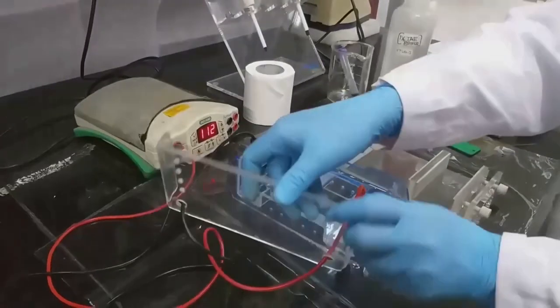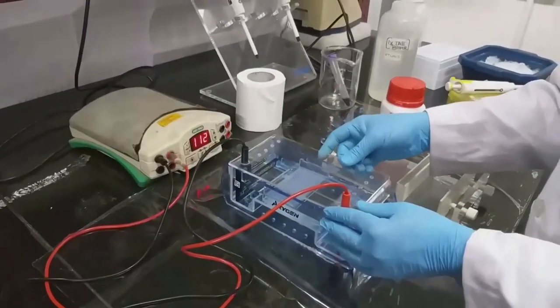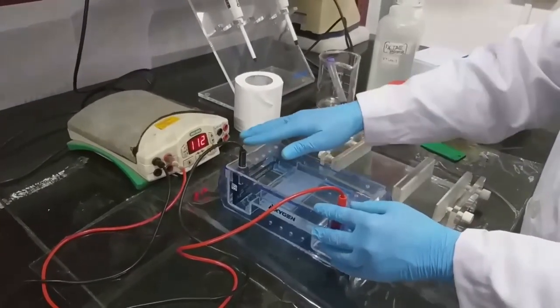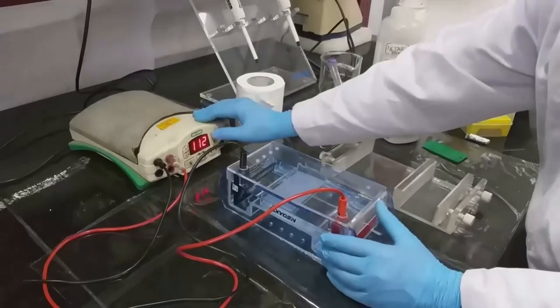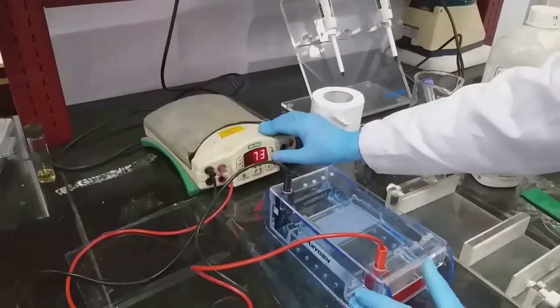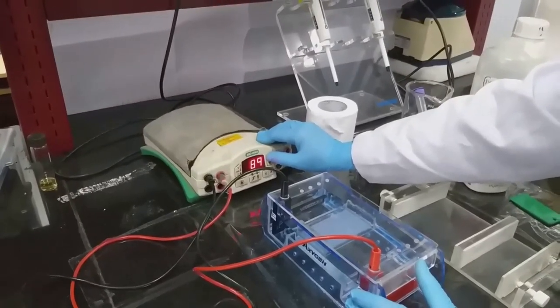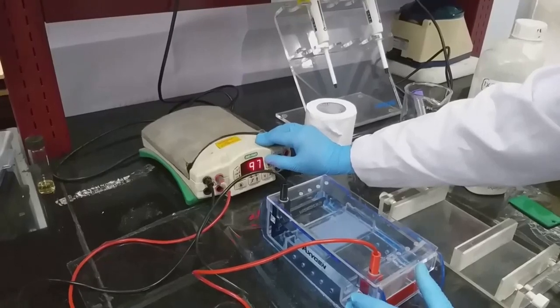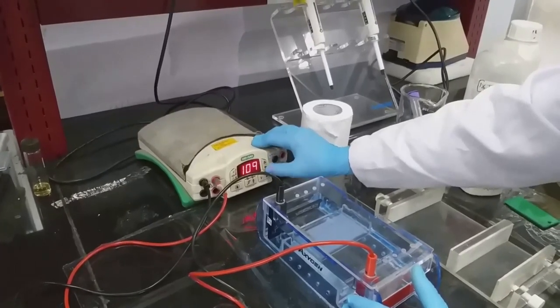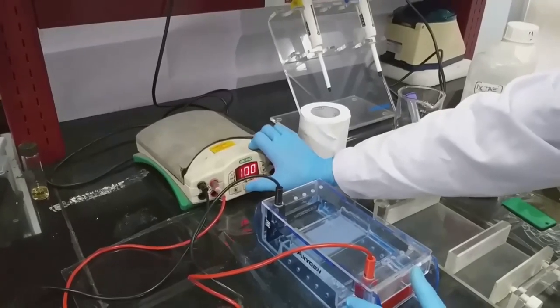The loading is over, we have to cover the electrophoretic apparatus with the lid and we have to adjust the voltage. Then start the run.